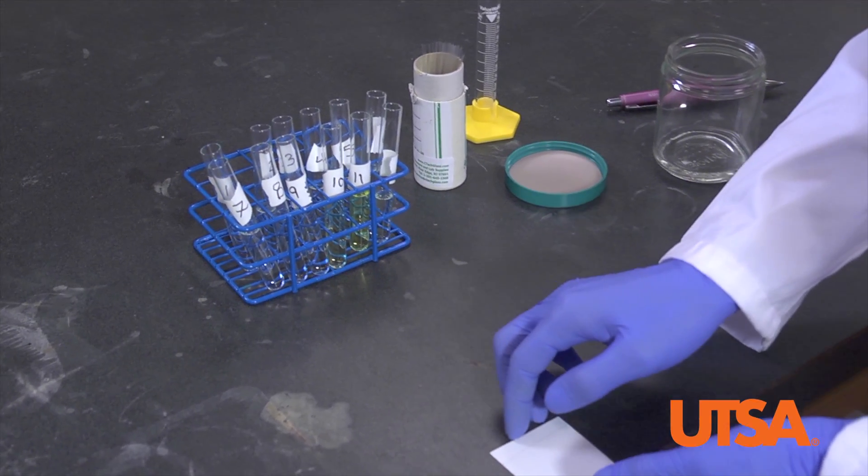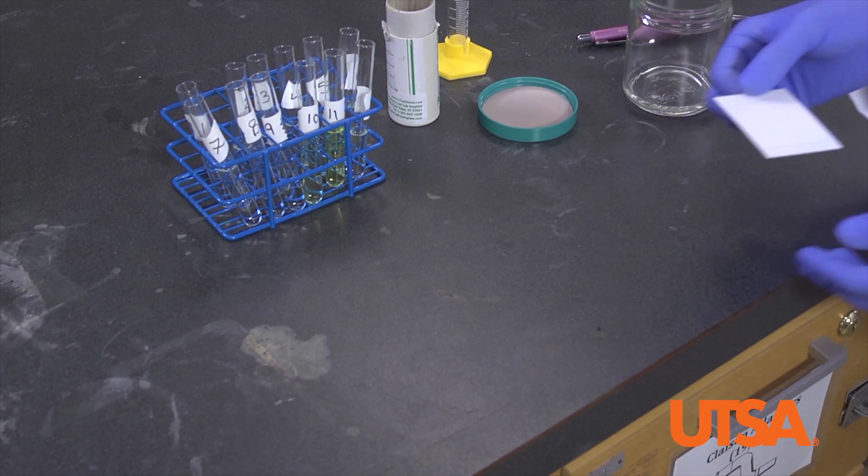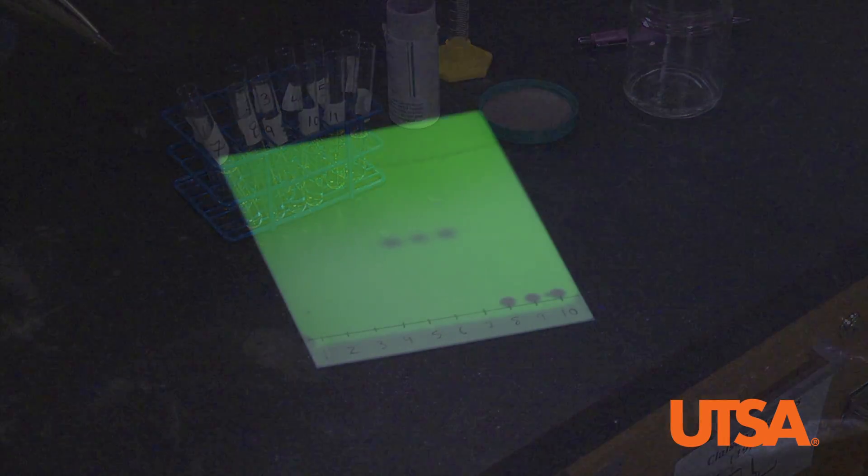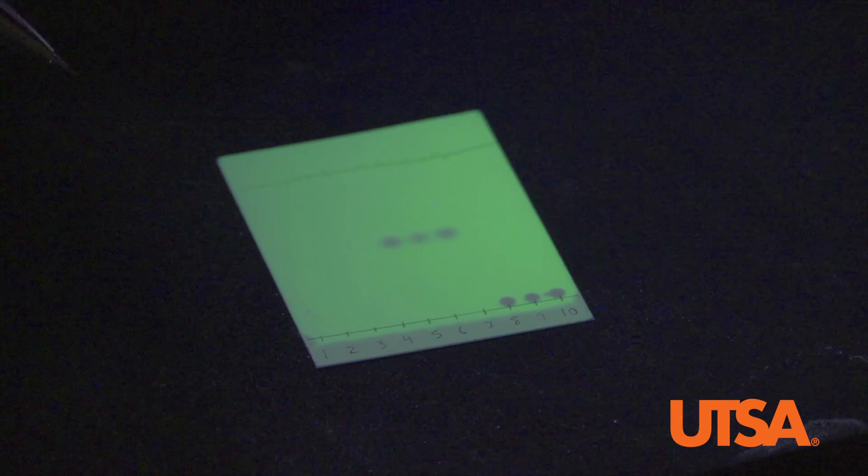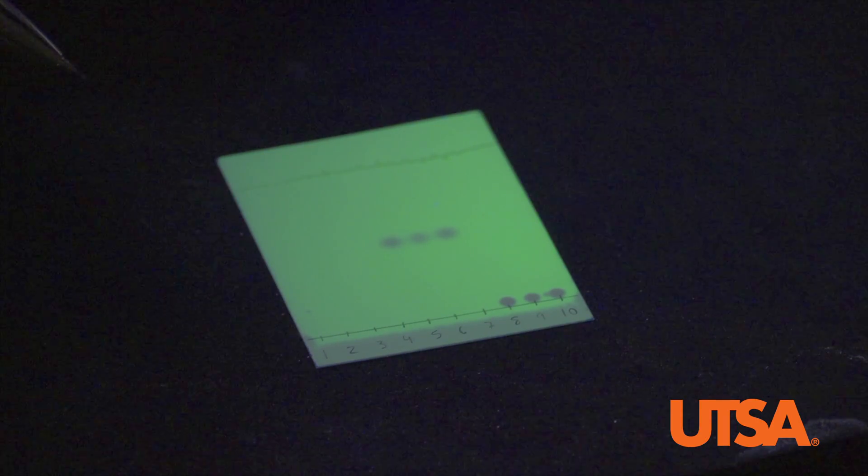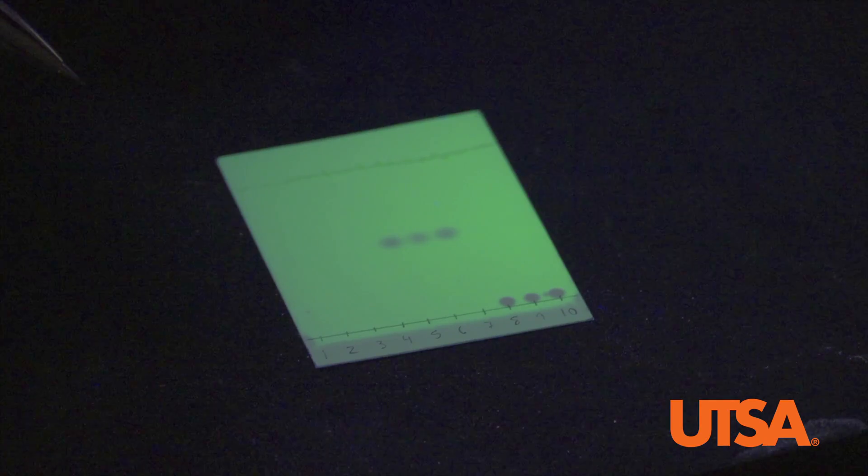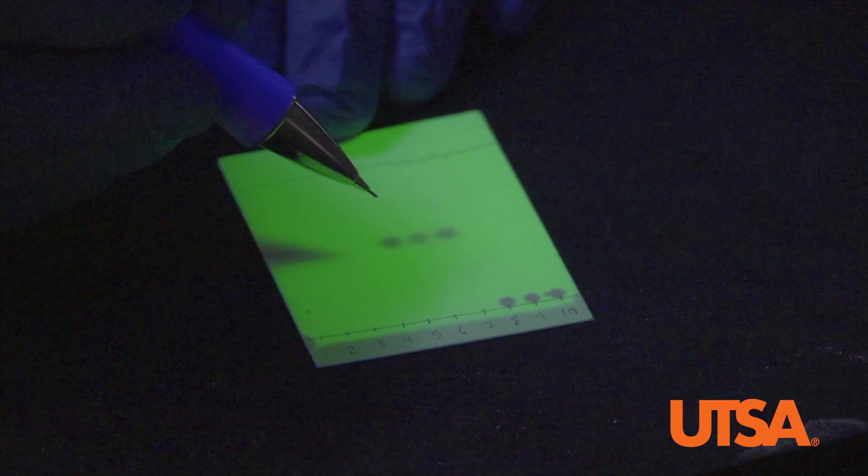Take the plate to the UV light. Under the UV light, use your pencil to circle the spots to visualize how far up the TLC plate they traveled. Circle each spot.